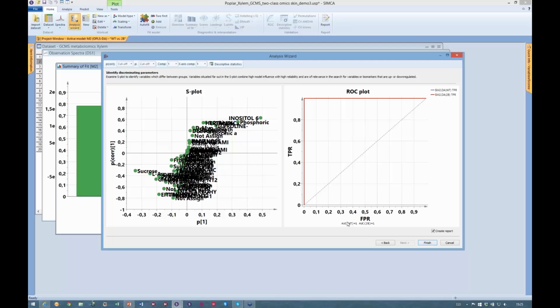The ROC plot is based on plotting, for various thresholds of the classifying parameter in the model, the false positive rate together with the true positive rate. And for a good classifier, you will then obtain a graph like this, a curve that has an arcing towards the top left-hand corner of the plot at the combination 0 false positive rate and 1 in true positive rate.